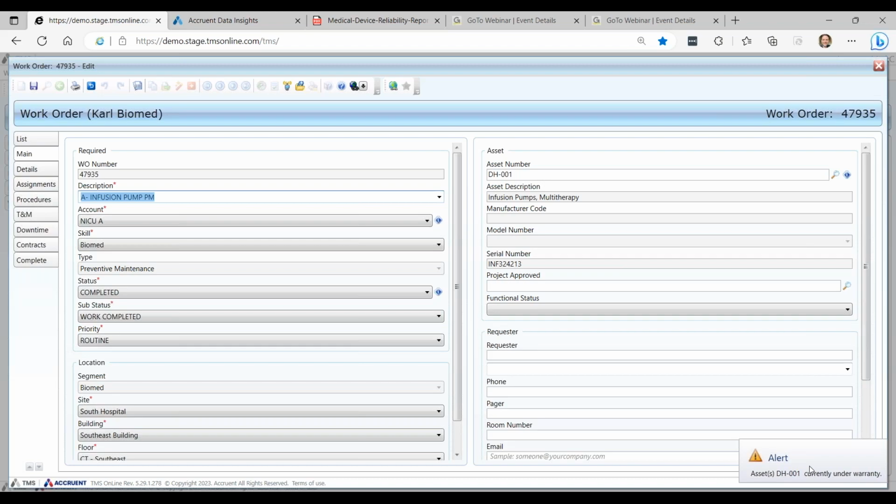So we were talking about maintenance schedules. Do you have, like, some lab equipment requires failure-based PM? So a PM unless something breaks. Yeah, PM on failure. It's one of the types. It's on demand is what we call it. So you create the schedule, you assign one or multiple procedures, and then you only generate it when you need it, like on failure. It wouldn't auto generate it. It's configurable that way, but it doesn't do it out of the box.